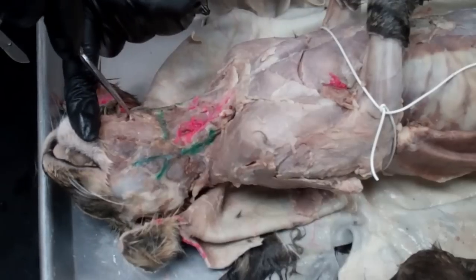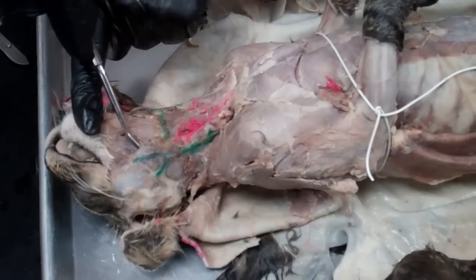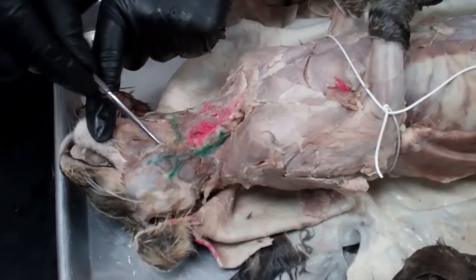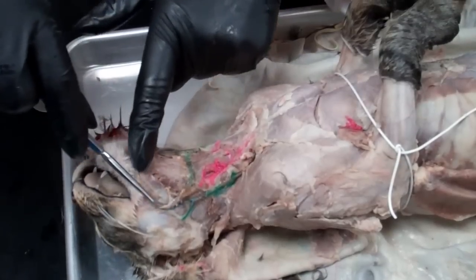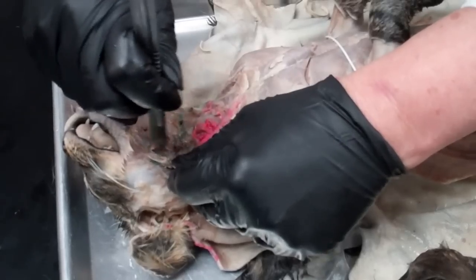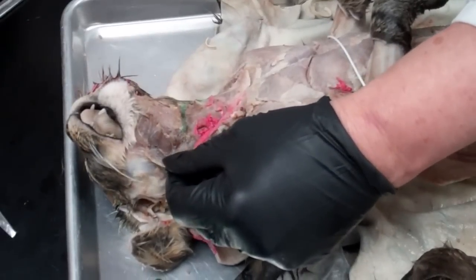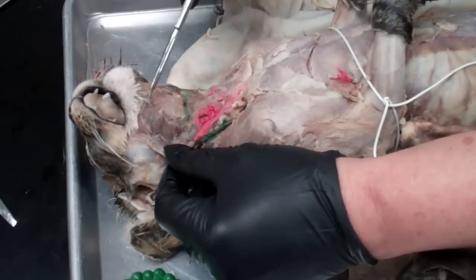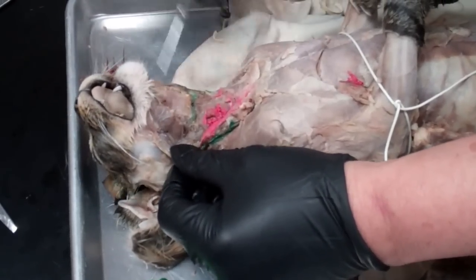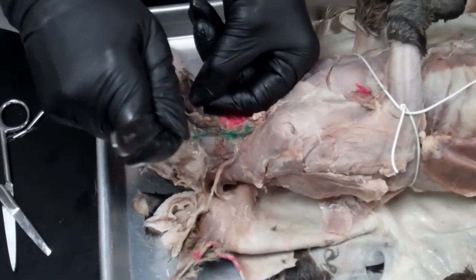On either side of the myelohyoid, you're going to find a diagonal muscle called the digastric muscle. The digastric muscle goes underneath the lymph nodes that you found. It runs diagonally, so you have to lift up the lymph nodes a little bit and pull them back out of the way. When you do that, you should be able to see this diagonal muscle. You'll want to get underneath that muscle and separate it from the others.